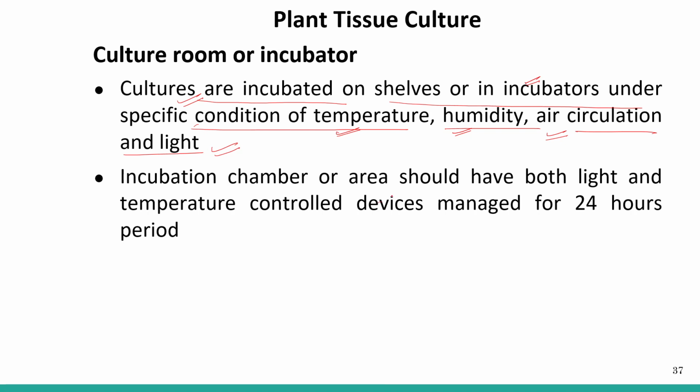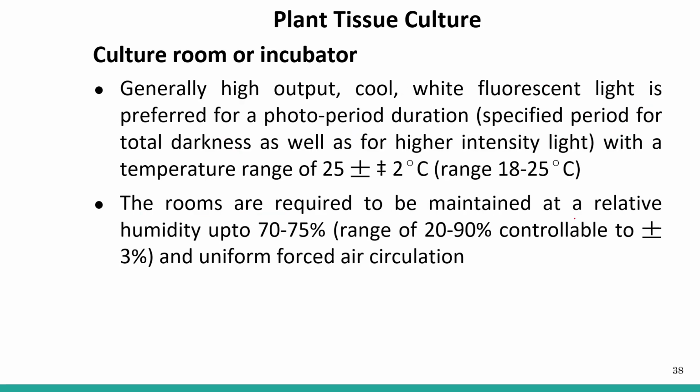The incubation chamber or area should have both light and temperature control devices, managed for a 24-hour period. Generally, high output cool white fluorescent light is preferred, with a specified photoperiod duration, a period of total darkness as well as higher intensity light, with a temperature range of 25 plus or minus 2 degrees centigrade, that is 18 to 25 degrees centigrade.